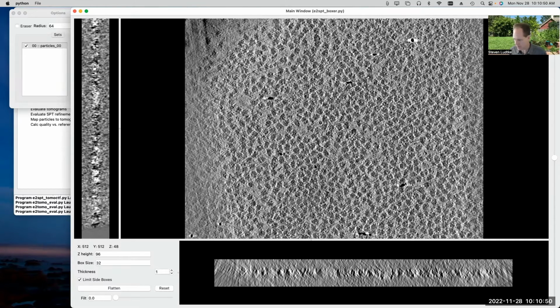And I gave some vague answers about, well, you look at that central section, make sure it looks good. Well, the other thing you want to look at is these orthogonal slices, and make sure that they also look good. So you can see the individual particles here in the orthogonal view, and you can see that they're nicely isolated along one line. This is what you'd hope to see for a single particle prep, to have all your particles more or less in the same vertical location. This means that it was a nice thin ice, and your data is all well localized.